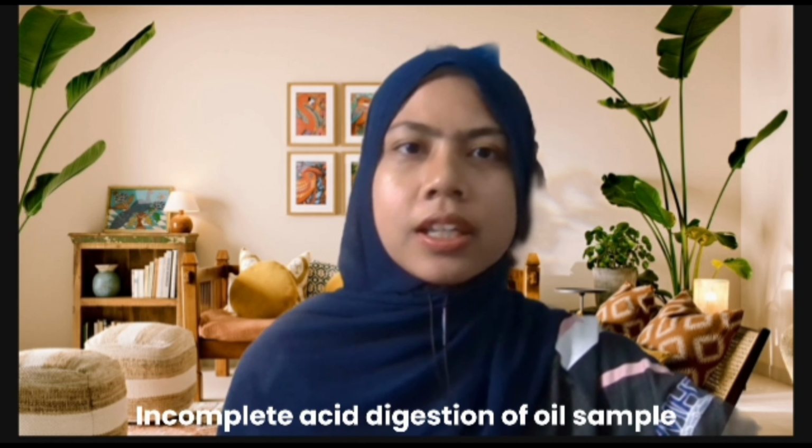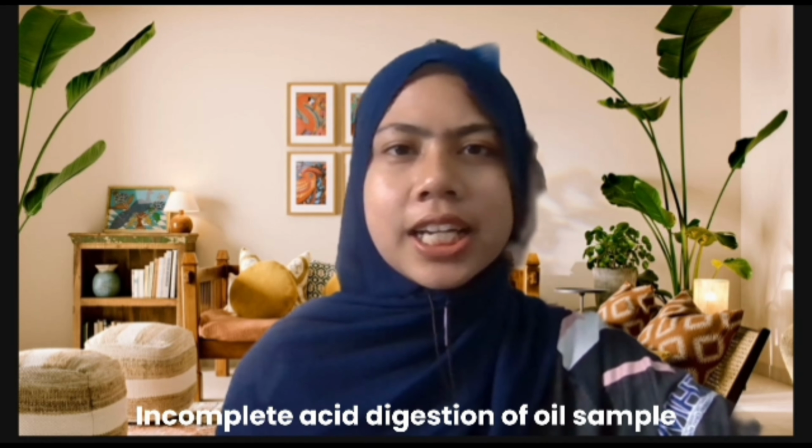For question 6, state two possible sources of errors in this experiment. First, incomplete acid digestion of the oil sample. If the nitric acid digestion is insufficient, Na plus and K plus may not be fully released into the aqueous phase, leading to underestimation of their concentrations.